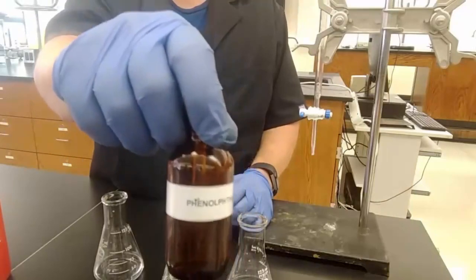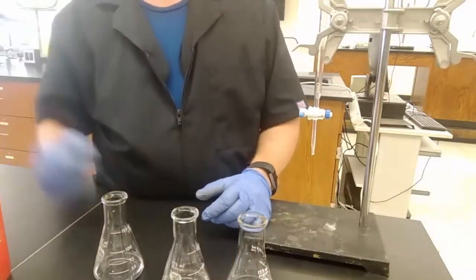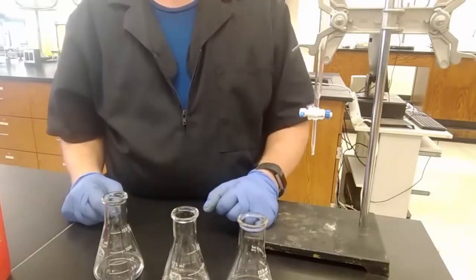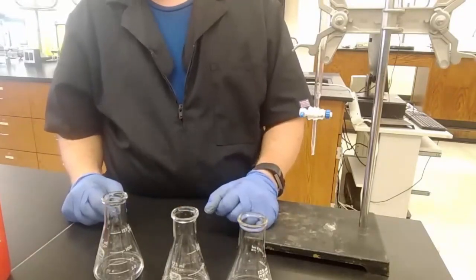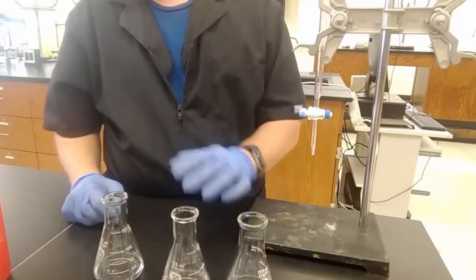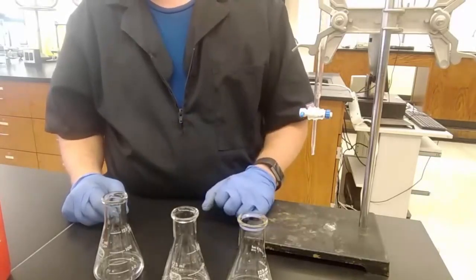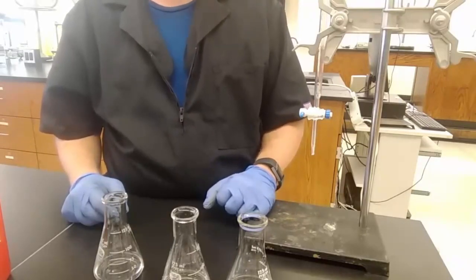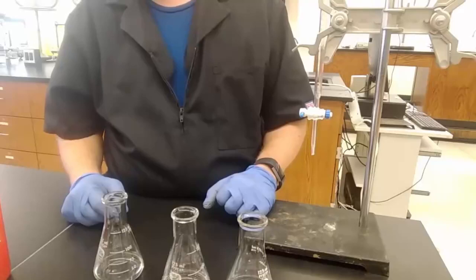Because acid-base indicators are themselves acids or bases. And so if I add a whole ton of indicator there, I'm adding extra acid. The question in the book says, what happens if you forget to add the indicator? Well, actually, the second question was, and what is the harm in adding more than 2 drops of indicator? I already answered that one. But the first question, what happens if you forget to add the indicator?